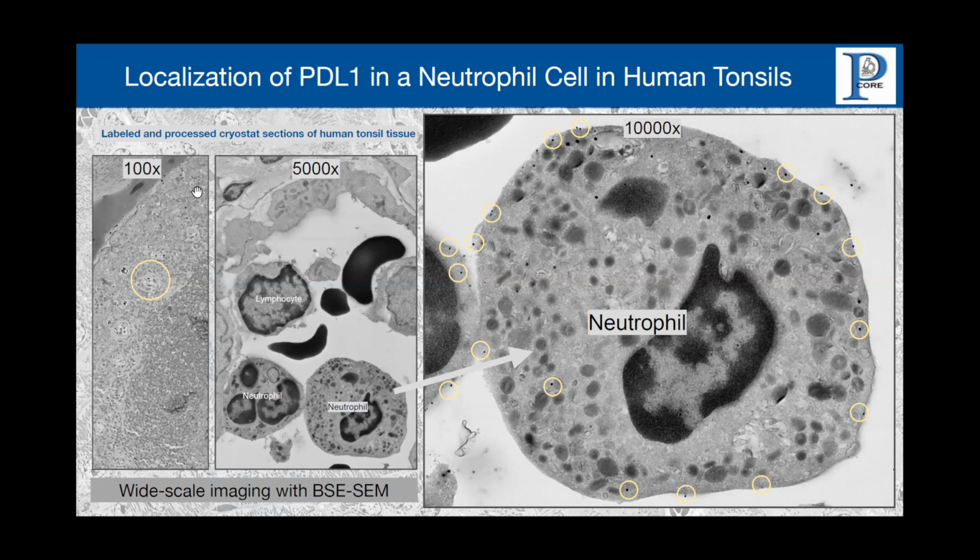And this is, again, what you see here is a wide field through a tonsil section, which was processed for immunogold EM with silver enhancement. This wide field allows me to find my area of interest. So for instance, here, I wanted to find these different capillaries. Now I zoom into these capillaries, and I see now here several cells, a putative lymphocyte and putative neutrophils.